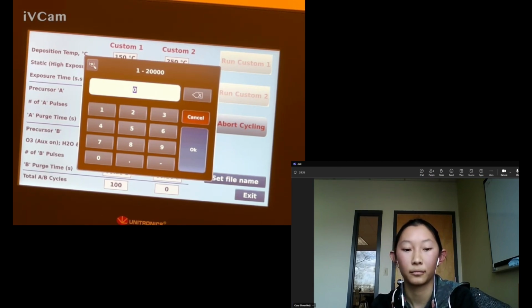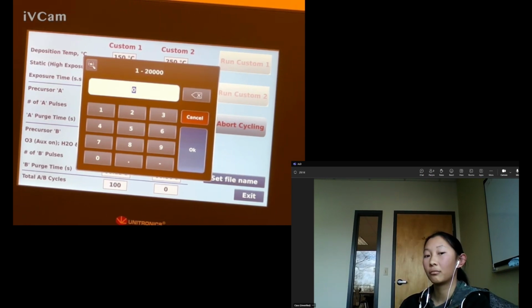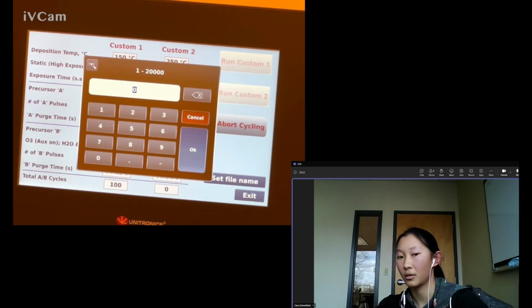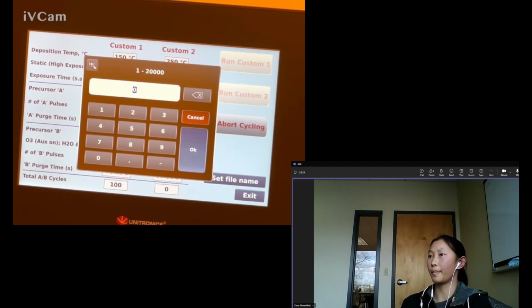Okay, so 0.4 to 0.5 angstroms per cycle. If we give 100 cycles, it will become like 4 to 5 nanometers. That's really small. And the total time it takes is like 1 hour. The platinum will take a lot longer if you're trying to grow thicker films, just because you have to purge for so much longer. Same with hafnia though too.